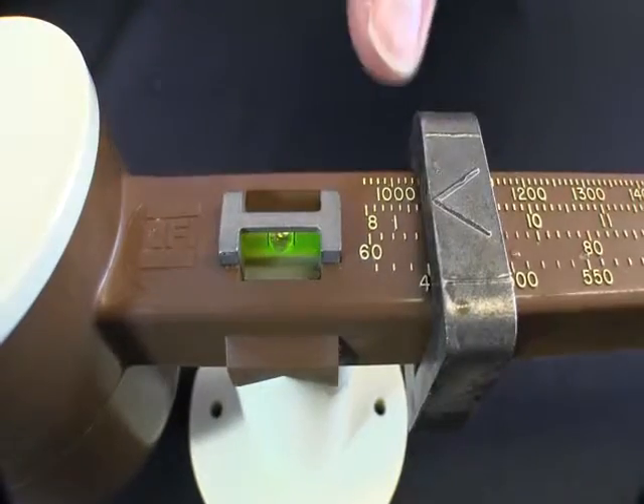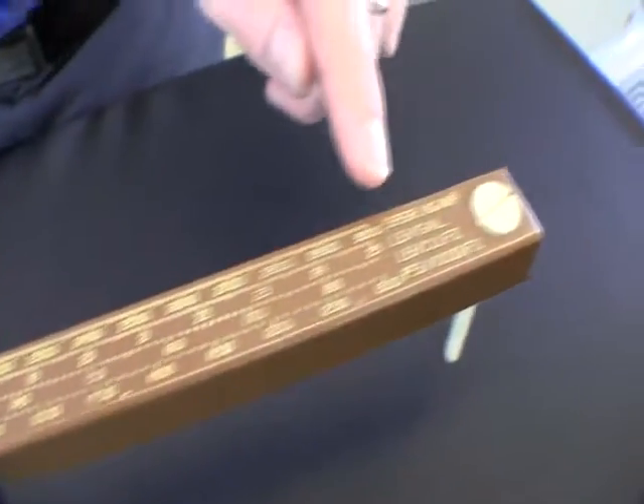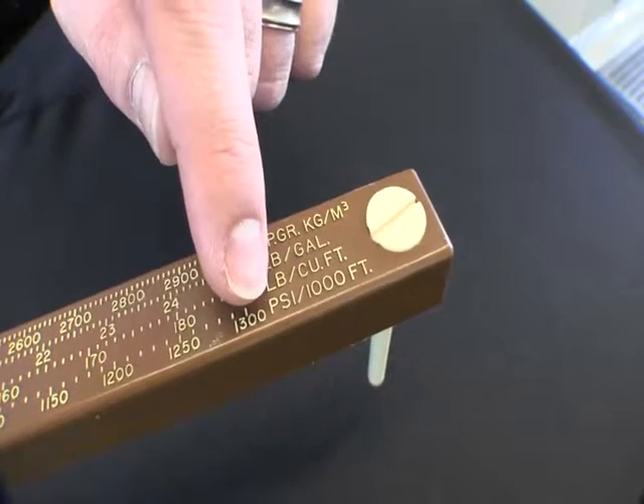When the bubble is between the two lines you'll know that the mud balance is level. Then you can take your reading from the left hand side of the counterweight. The mud balance scale has four units of measurement: specific gravity, pounds per gallon, pounds per cubic foot, or psi per thousand feet.